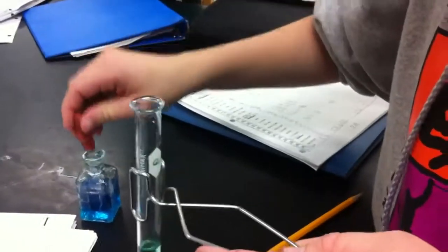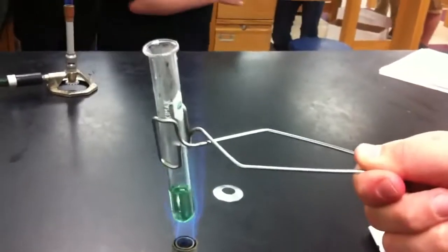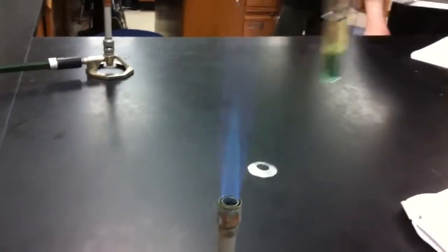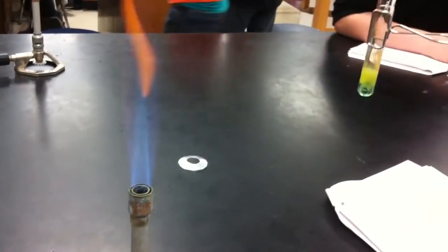One squirt. Now let's hold it over the Bunsen burner — see the darkest blue flame? Let's get it right there. One, two, three, four, five. It's like browning. Yeah, it's supposed to do that. If it's a sugar, it does that. Hold it a little higher.